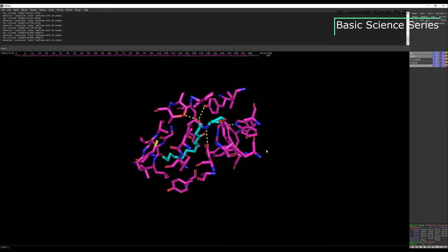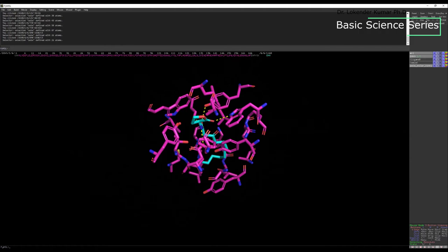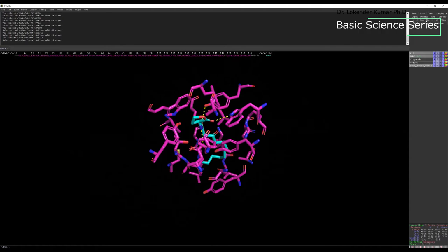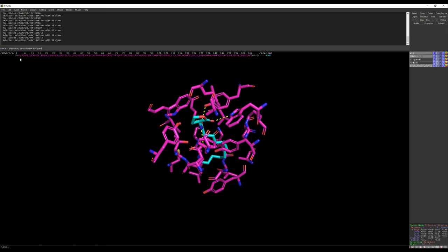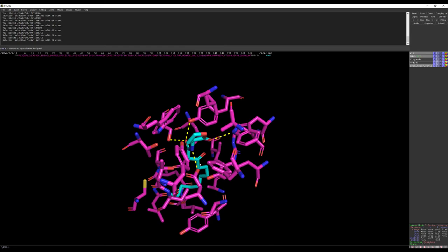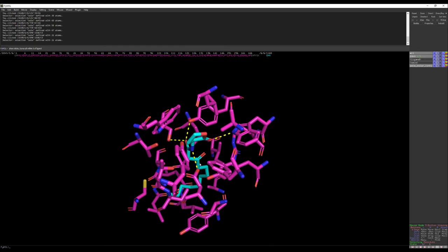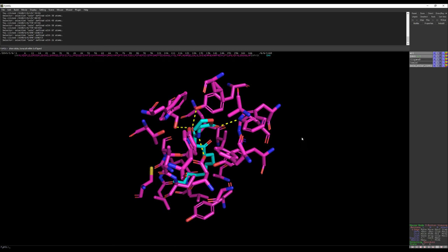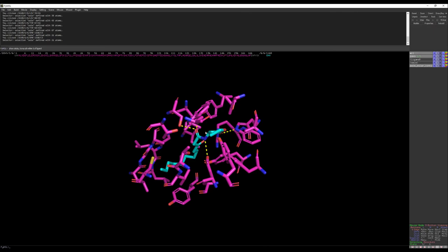This is really useful information you can extract from PyMOL. The command is: show sticks, byres, all within 5 of ligand. It's really important that you consider the commas and spaces when providing commands to PyMOL software. Every time you want to extract information of the ligand, rename the ligand molecule and then extract the information. This is really important when you compare your docking poses and compare structures.